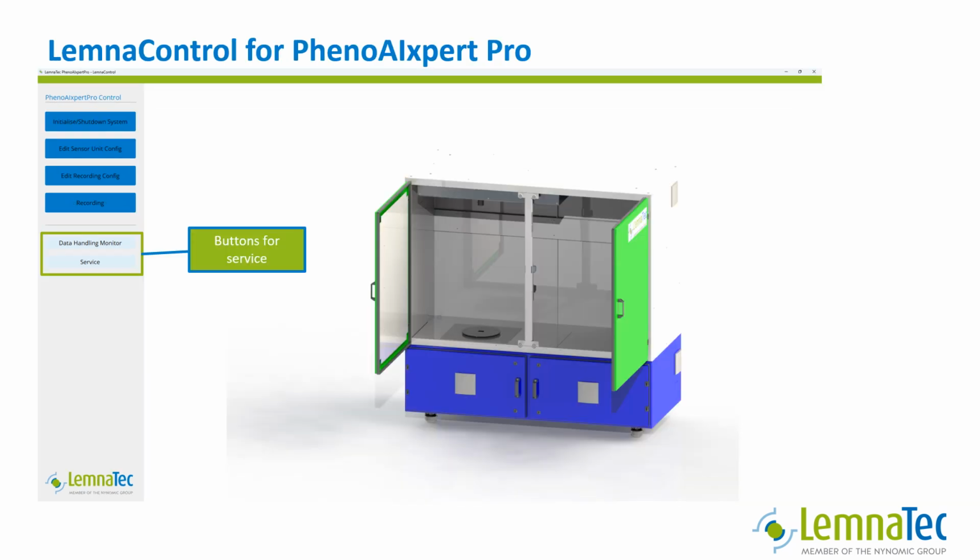The data handling monitor tracks all actions of the system. It also tracks if an error occurs during operation, so it is helpful for troubleshooting. The service button is for our software engineer accessing the system for service issues.